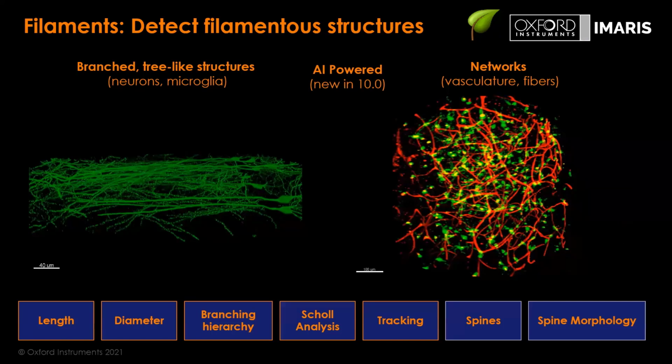You can get from parent to daughter cells, and you can get all of those statistics. So if you can A, see it, I mean, there's nothing blocking it, and B, it is resolved to a point that you can actually detect it. If you cannot see it with your eye, like if it's resolved to less than 1 pixel, then the software is going to have a hard time extracting those in good detail.